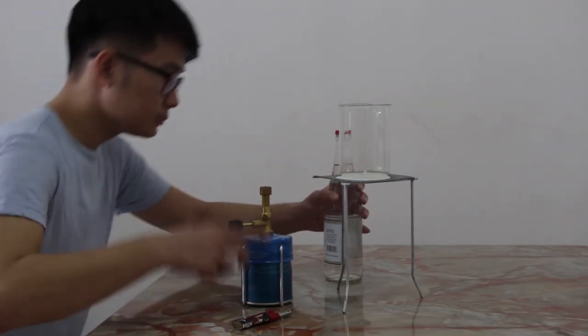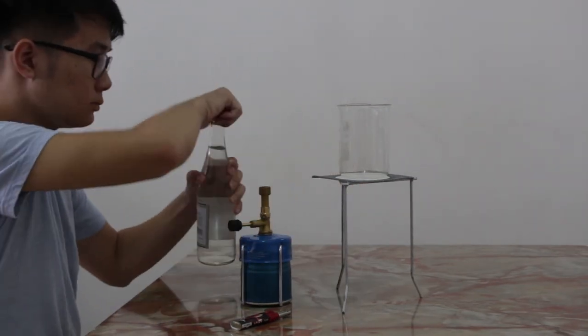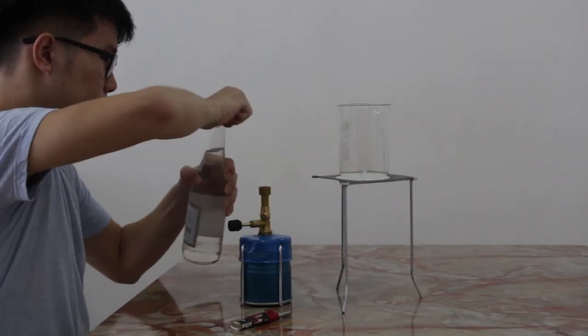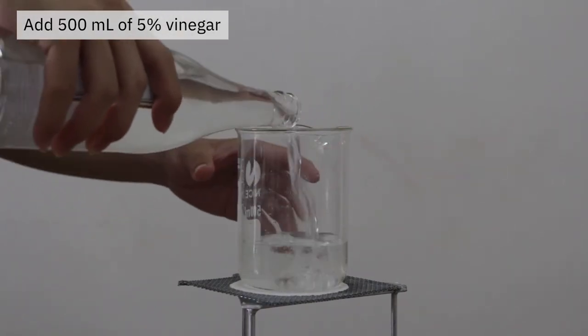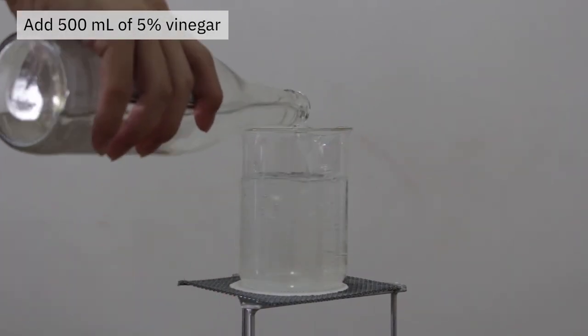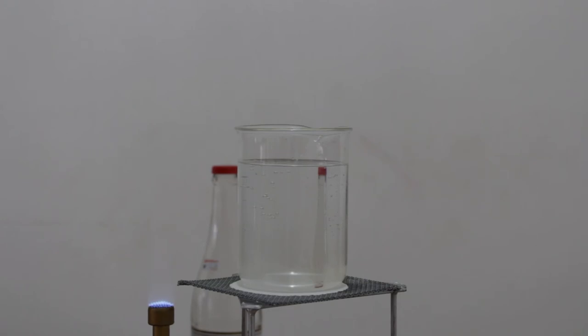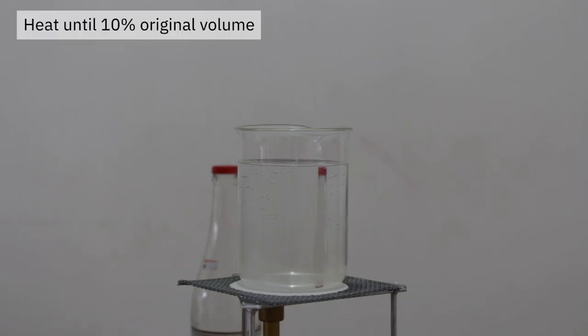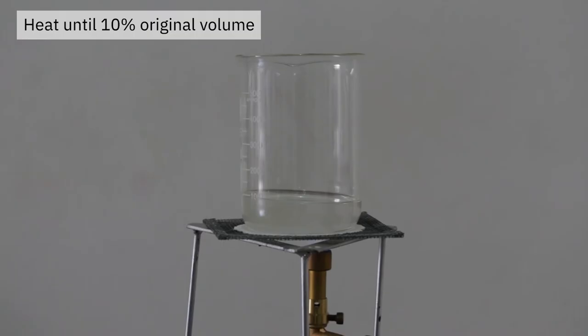The third part of the experiment then uses the earlier ethanol to synthesize ethyl acetate. 500ml of vinegar is poured into a beaker. Then, the vinegar is heated and boiled until only 10% of the original volume is left.